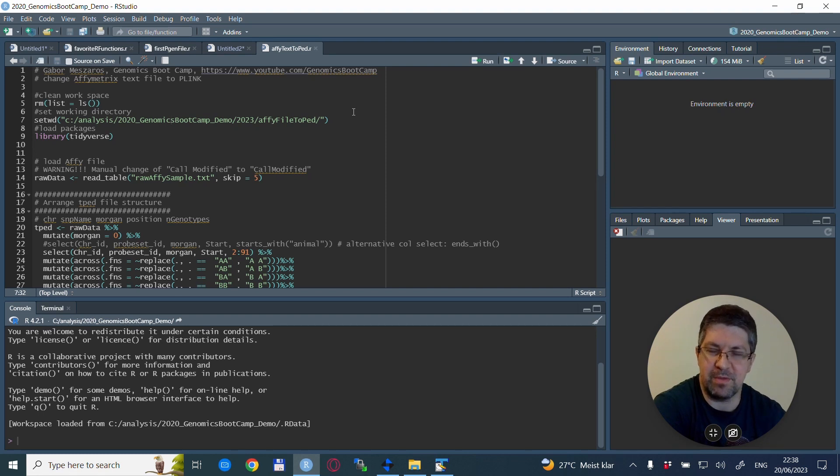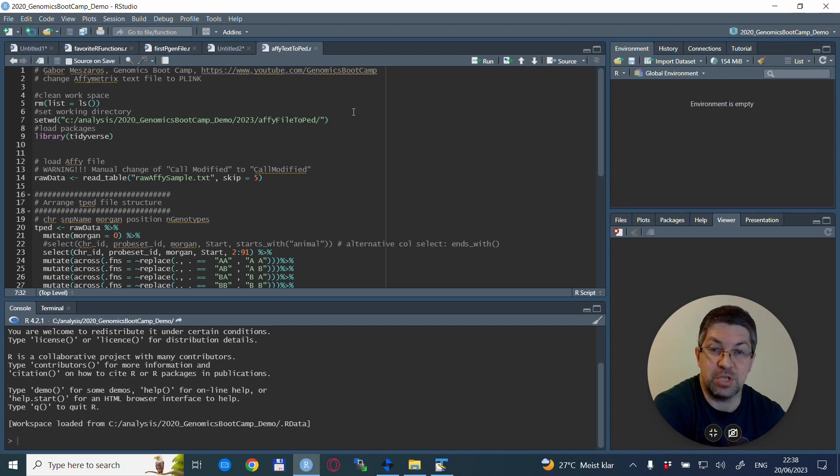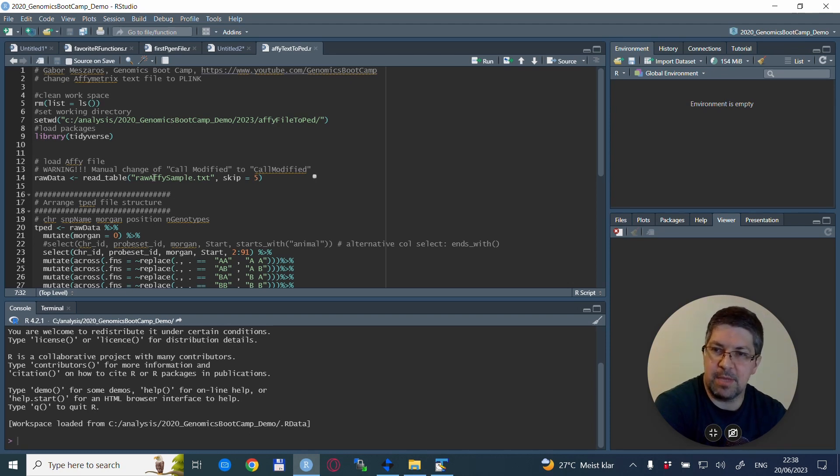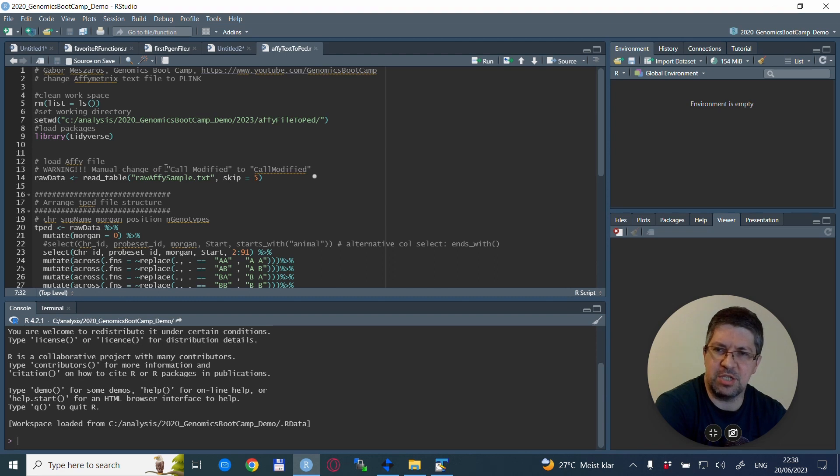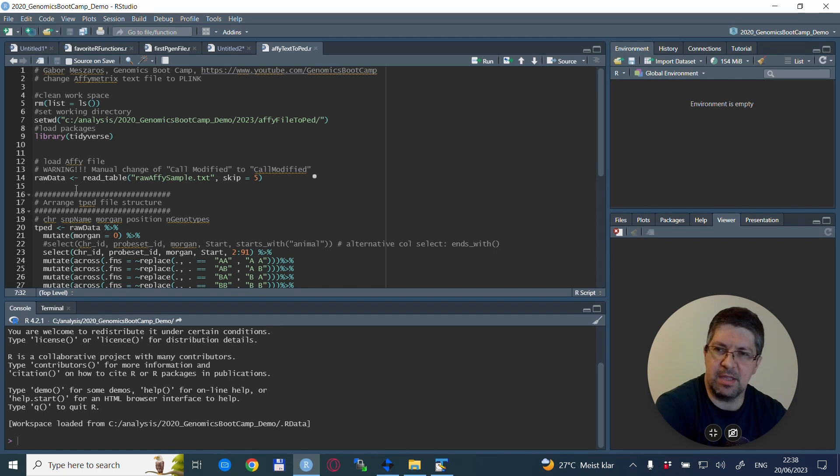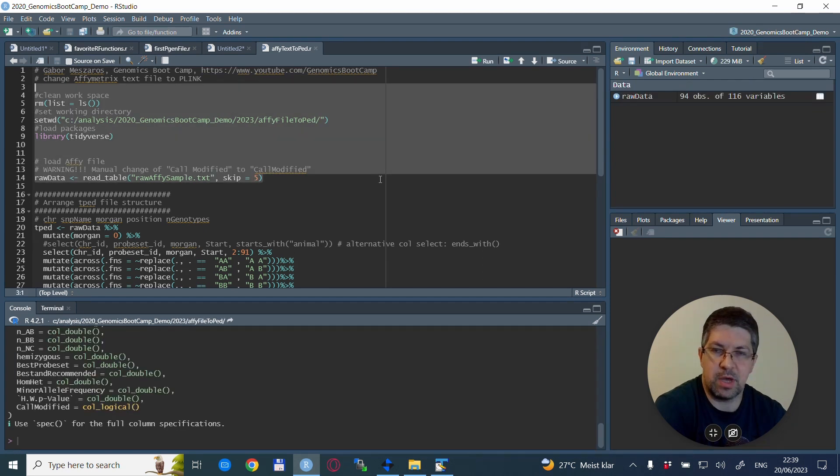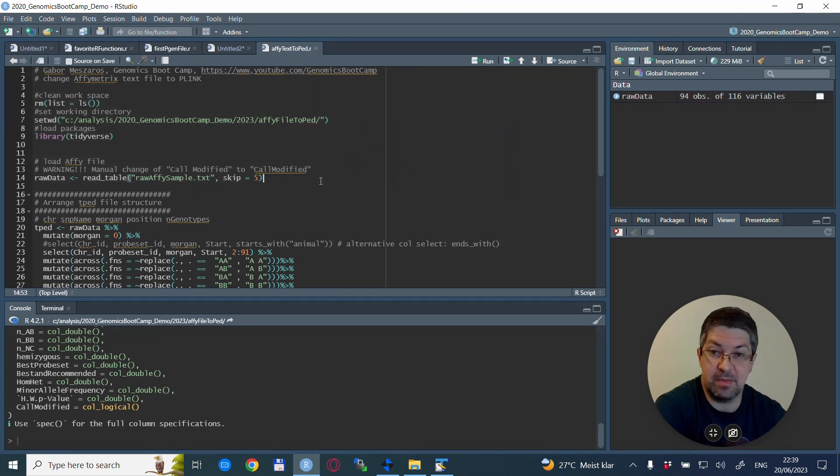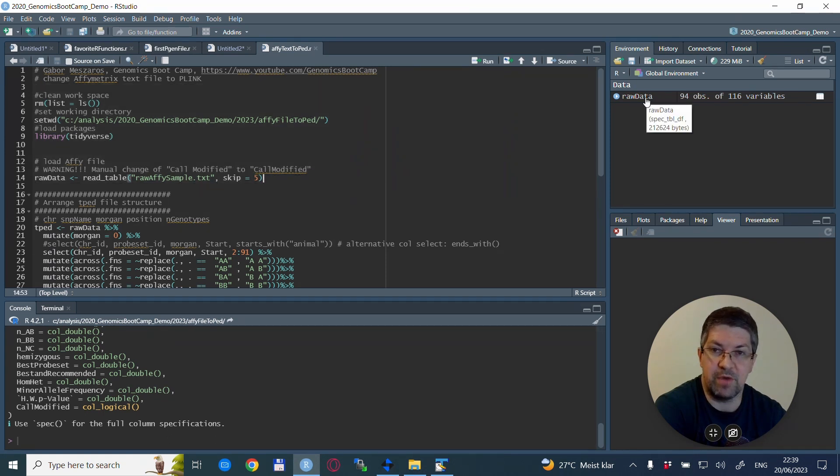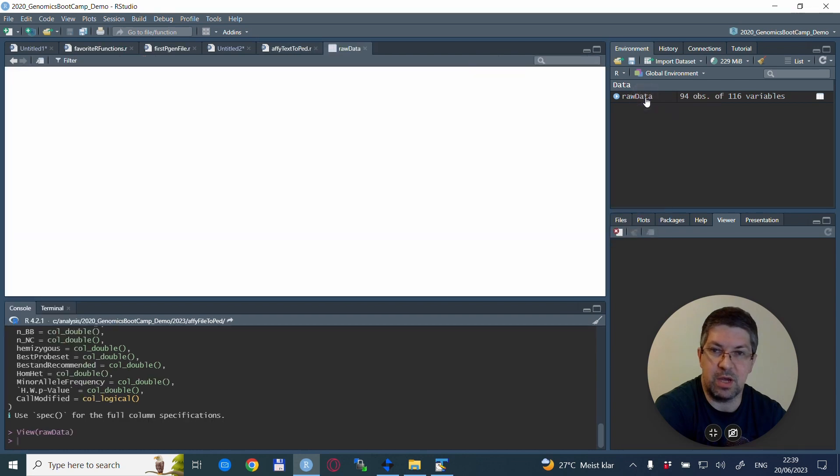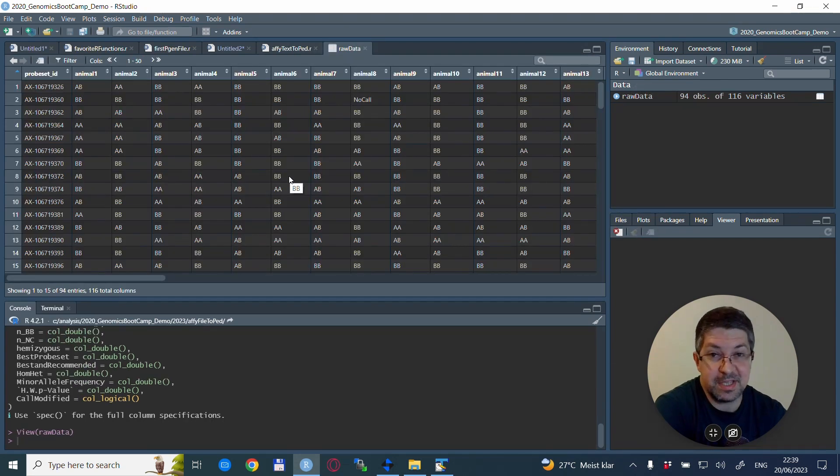Kind of a practice for a real situation where you will have your own raw Affymetrix file that you want to change to ped files. As I mentioned here, there is a warning line that I changed manually, this 'call modified' to 'call modified' without this space. And we read it in with the tidyverse read_table function. So I run these first few lines.